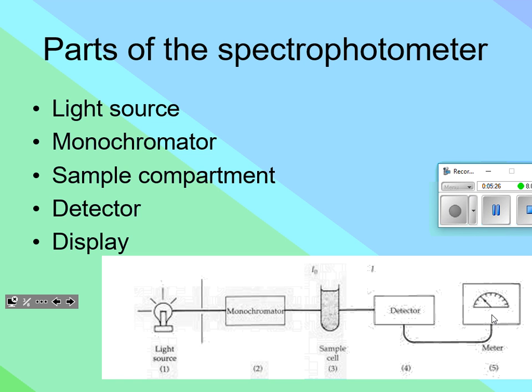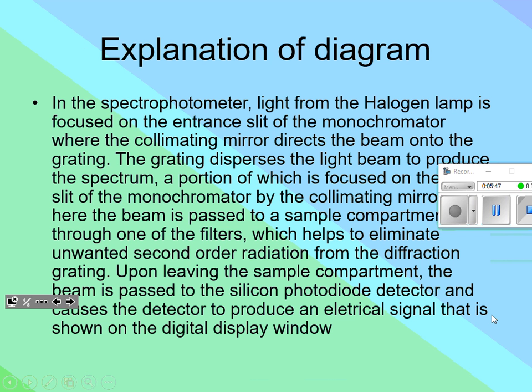So the thinness of that test tube, that cuvette, plays a role as well. Because if I start turning it on its side, if you're looking from the top, it doesn't look actually as dark as this one here. So a lot of mathematics goes into making this machine work the way that it does. We more or less just have to make sure we know how it works. And that's this explanation right here. Again, you're not going to be testing any of that.